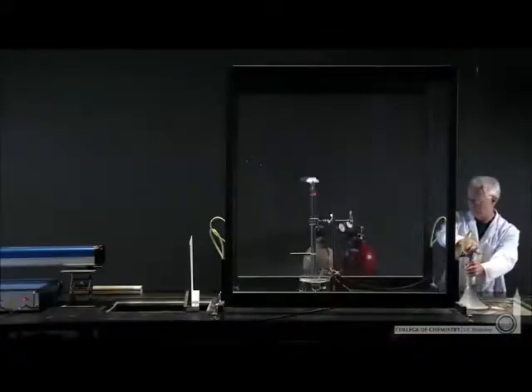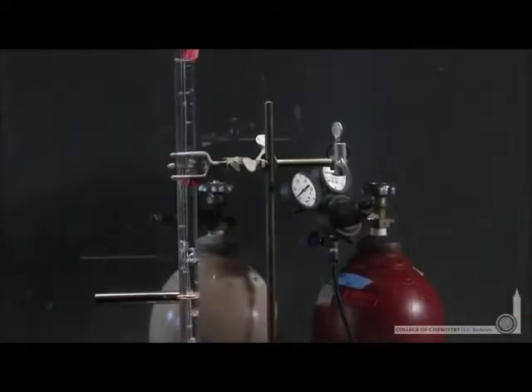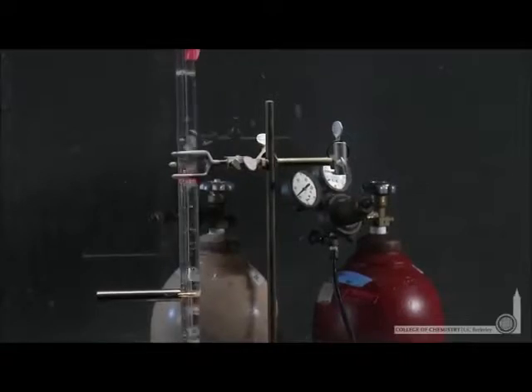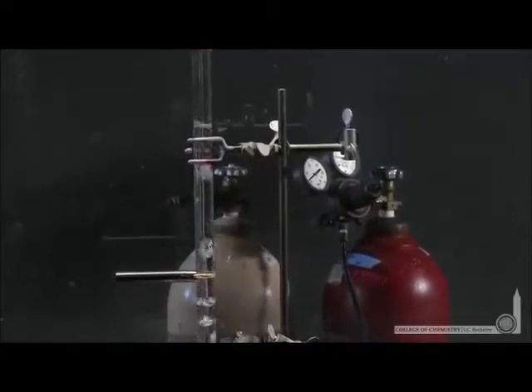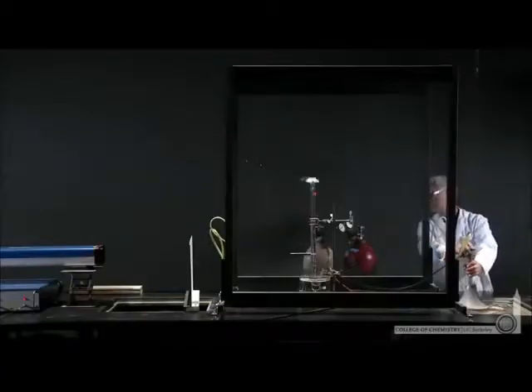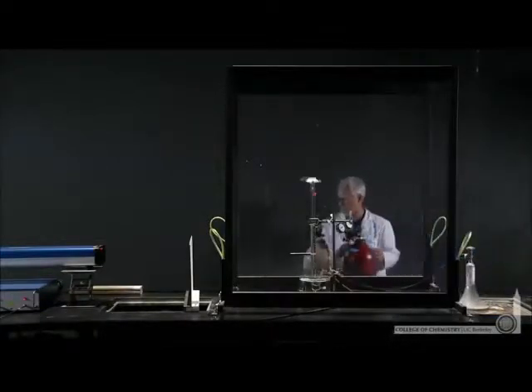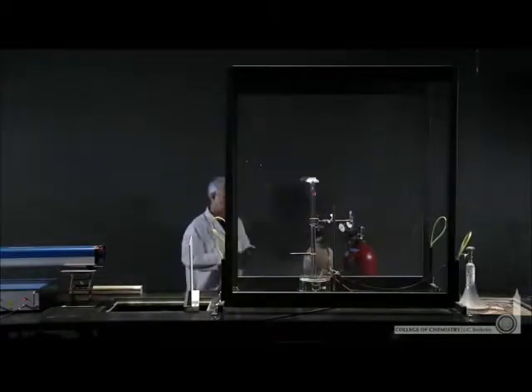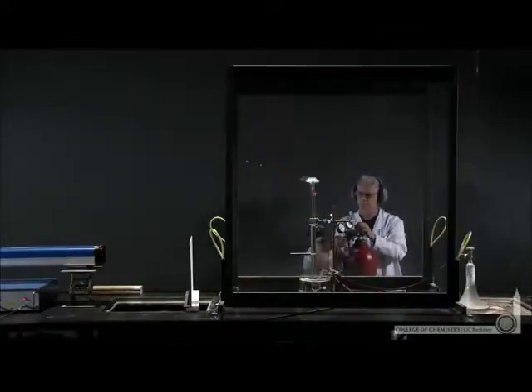Now he'll add chlorine gas, Cl2, and Cl2 is a slightly yellow-colored gas. He'll bubble that into the cylinder and then add an approximately equal volume of hydrogen gas, H2. The H2 is in the red cylinder, and as he prepares to add that, let me tell you that the chlorine-chlorine bond, Cl2, the homonuclear diatomic bond, is a relatively weak bond. Cl2 bonds have about 250 kilojoules per mole. Now, that bond is susceptible to being broken by photons in the blue region of the visible spectrum.